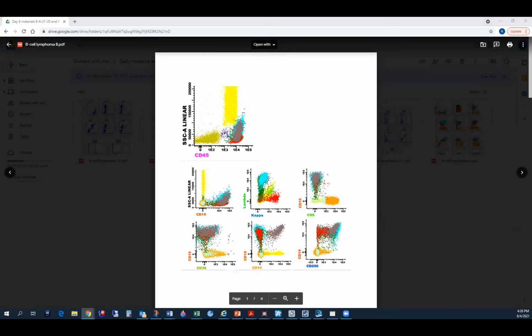So this is my first time to study the flow cytometer so deeply. In the first plot, we can see multiple types of cells. So how can we focus in particular so that we can reach a final diagnosis? Here we can see yellow and some gray.